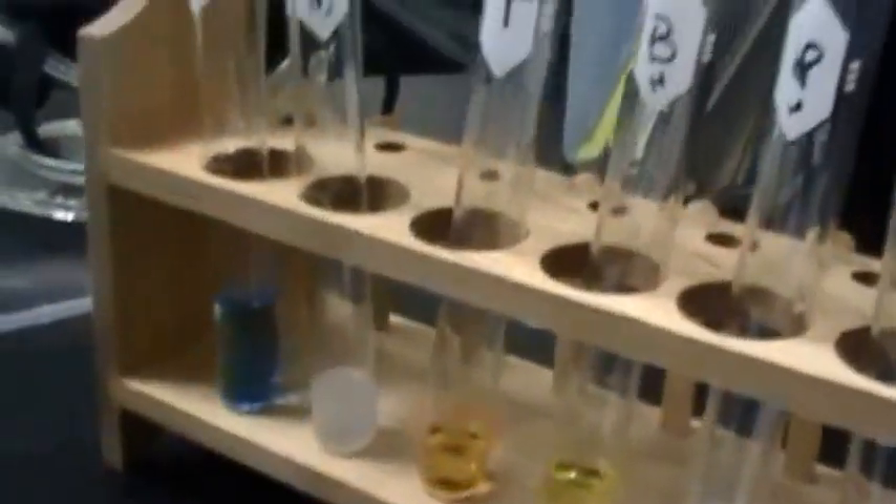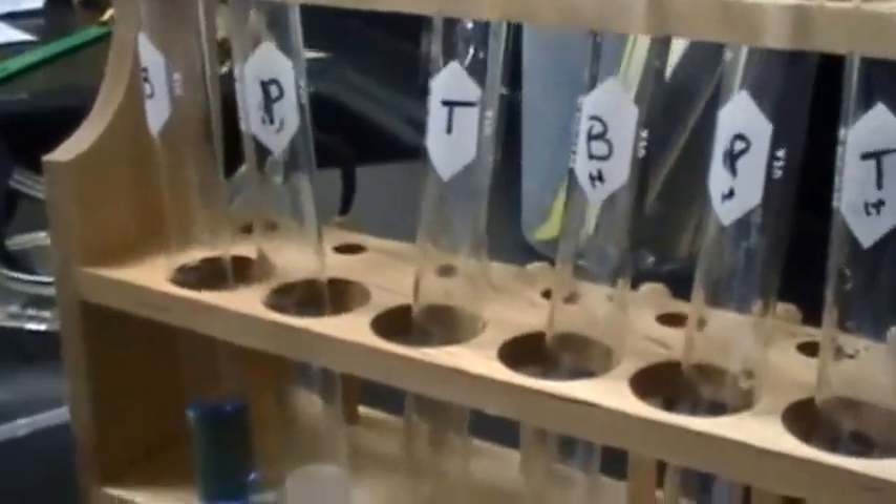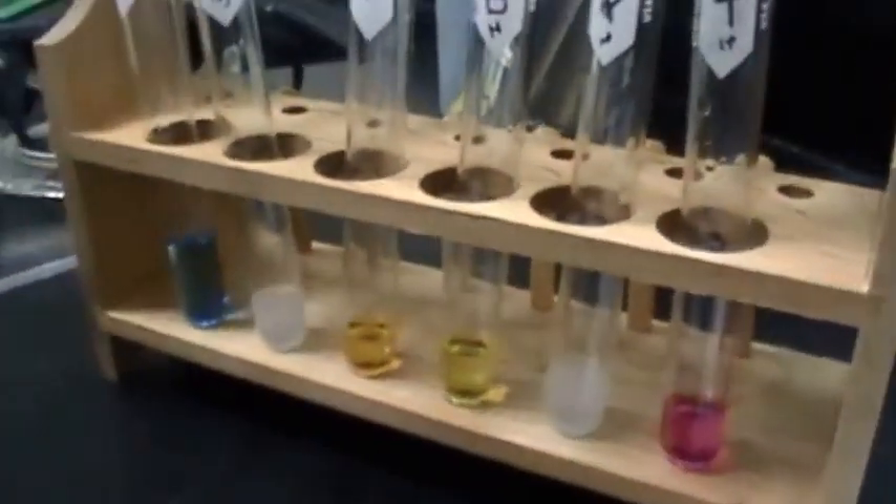Now we're going to move on to phenolphthalein and acetic acid. We're going to put in 1 ml and see if there's a color change. It disappeared so I don't think that counts. Stir it.